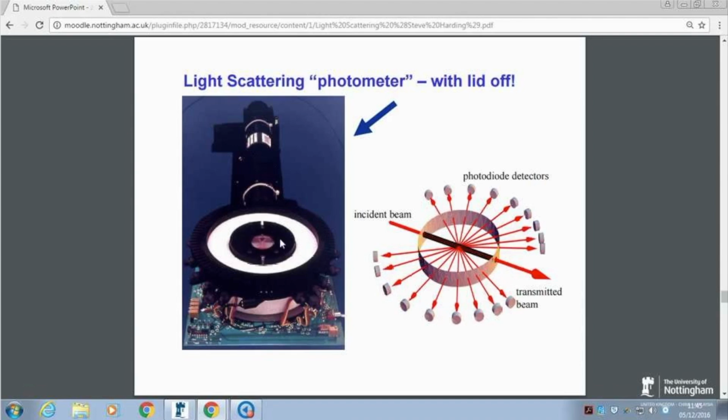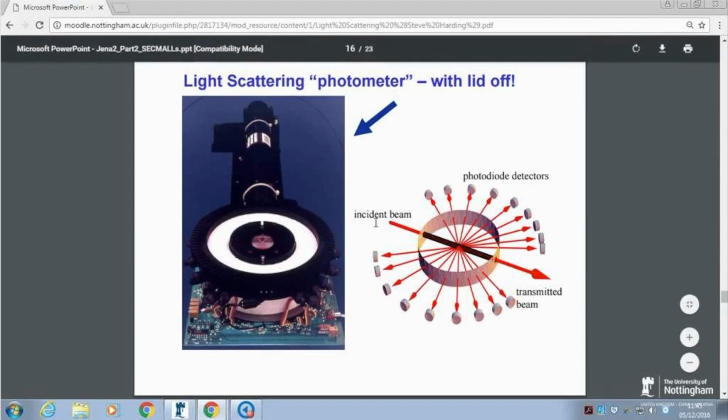So you get these instantaneous snapshots of intensity as a function of angle. And you got the concentration as well from the refractive index detector being measured at the same time. So for each volume slice coming through the column, we get this snapshot of intensity against angle. We've got the concentration, so we can work out the molecular weight of everything that goes through the column.